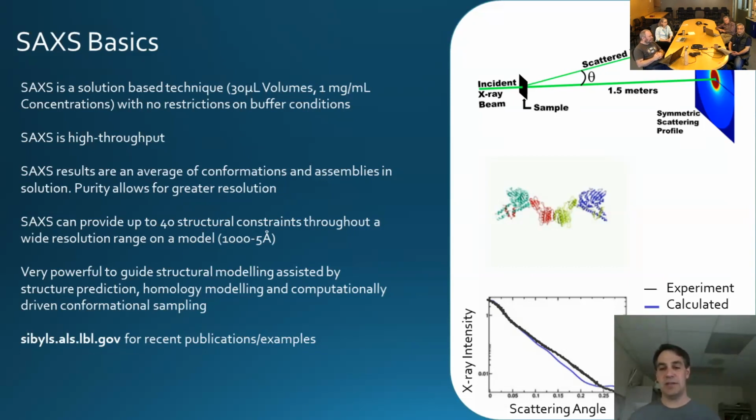So just to give you an idea of the scattering, using the conformational sampling. Here you can see a protein undergoing conformational change in silico up there, PDB model. The SAXS profile is calculated and compared against what was measured in solution. So you can pick out the conformation that was present in solution given this huge ensemble. And that's a very common use of small angle.